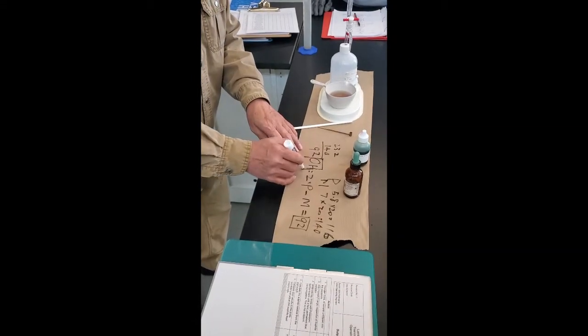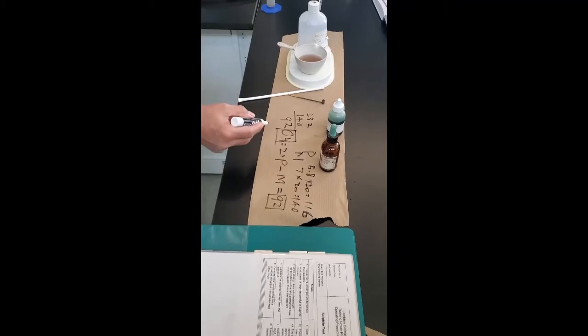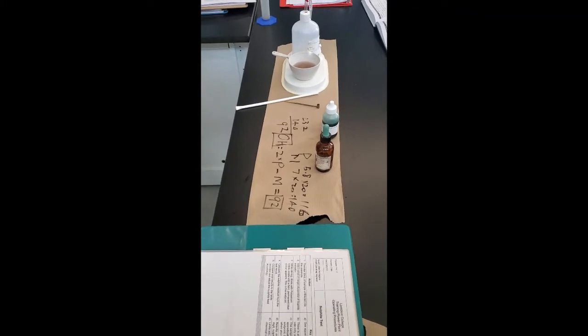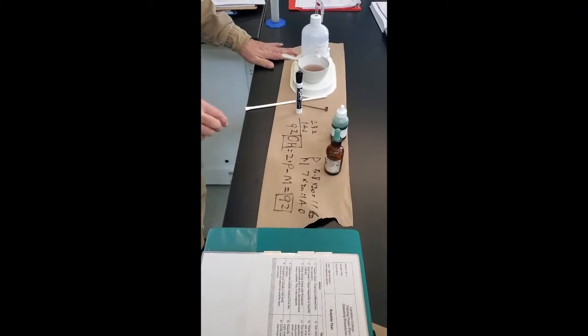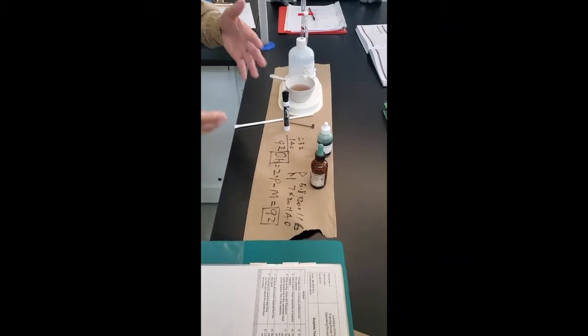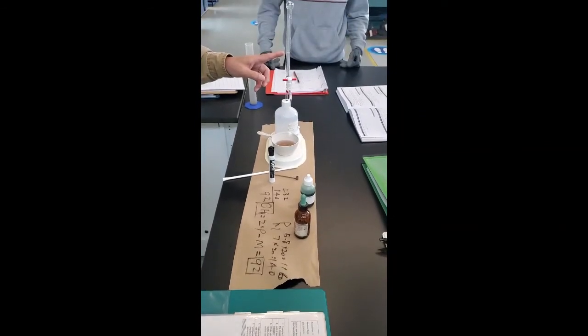Now you see, the P and M, you do the test. And the OH is a calculation. 2P minus the M. Again, I want to remind everybody, when you do P and M test, you use the same sample, go all the way from P and M all the way, and then you do not reset the burette.